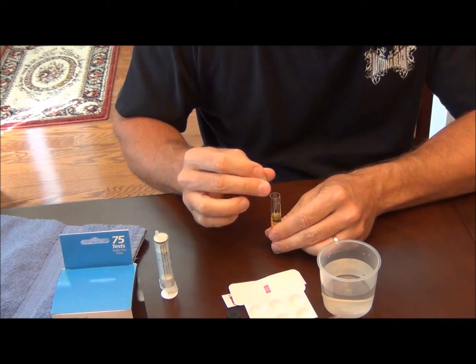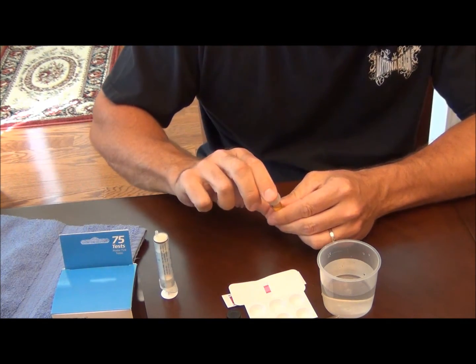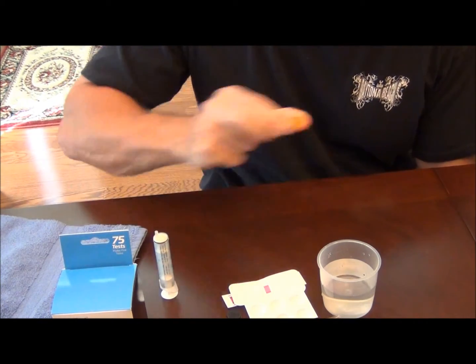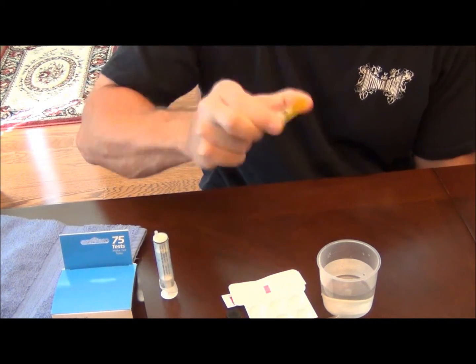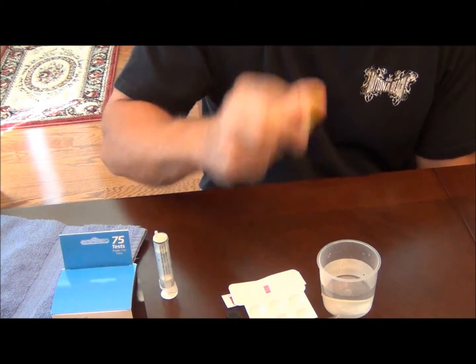Shake the test tube vigorously for one minute — 1, 2, 3, 4, 5, 6, 7, 8, 9, 10.